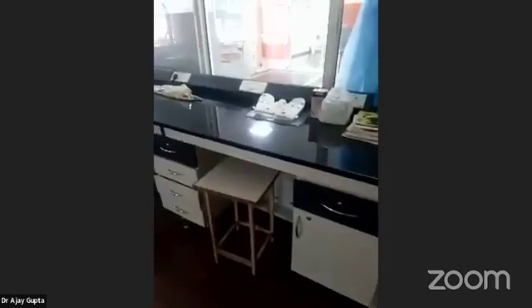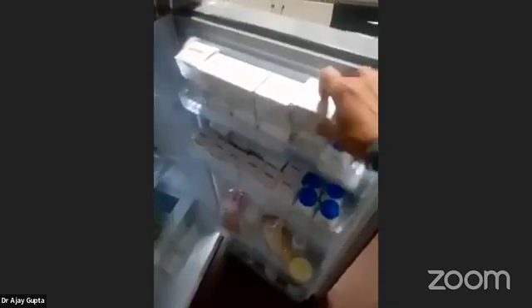A refrigerator is there to store the media and the heat-sensitive chemicals. We use RO water, which is highly pure water, and for media melting, we use the microwave. So this is the media preparation room.